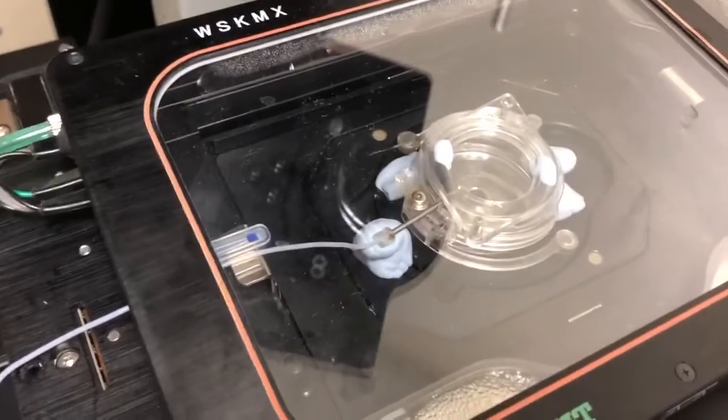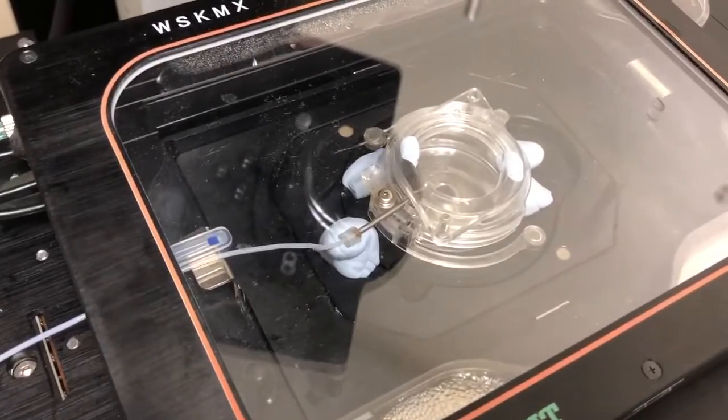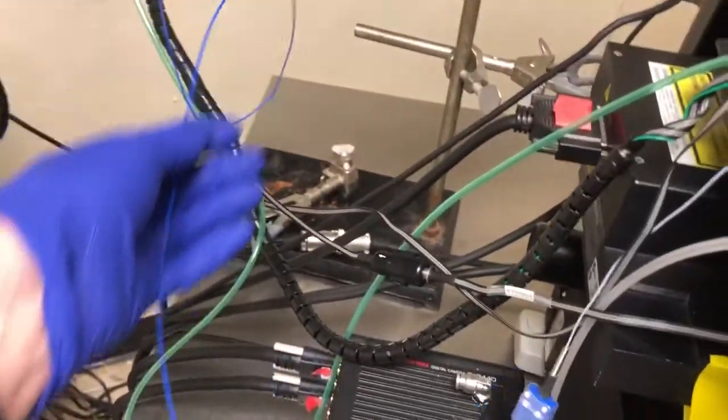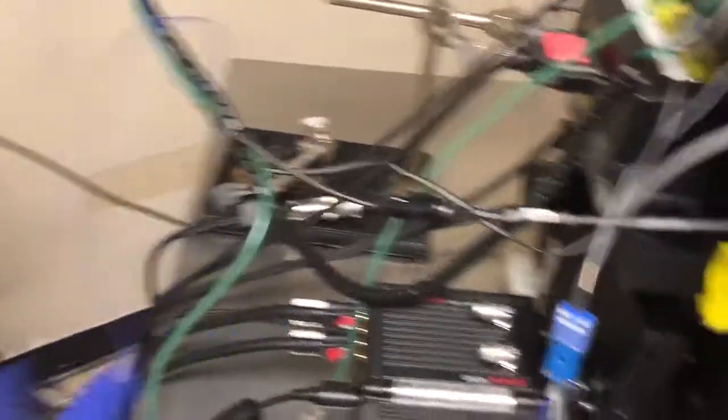As you can see, the temperature sensor, which is that metal rod, is in the sample. So again, it's the metal rod connected to the end of this blue cable.